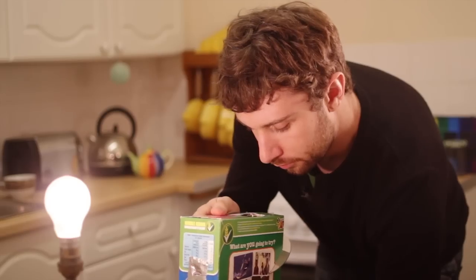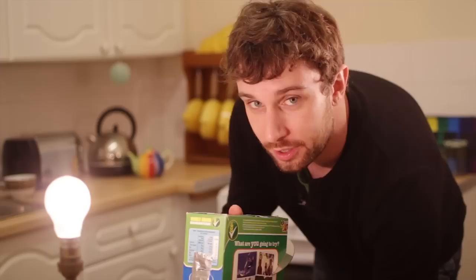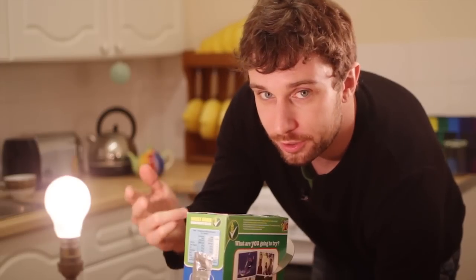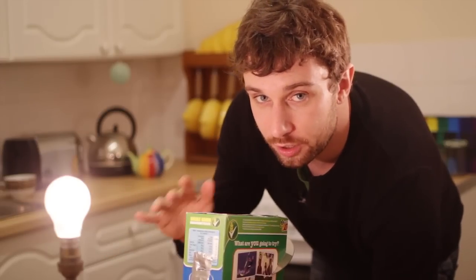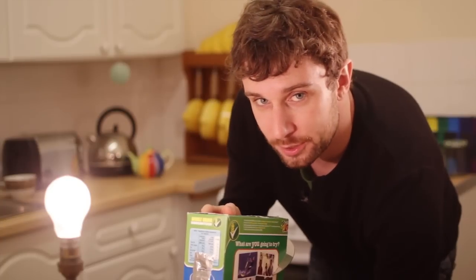Now you've just got to point this slit at any light sources you want to examine. So we might try a tungsten light bulb — that's one of the eco-unfriendly ones that get very hot when you turn them on. For a tungsten light bulb, you should see a complete rainbow: red, orange, yellow, green, blue, indigo and violet. That's because the white light given off by the tungsten bulb is actually a mixture of all those different colours — it's just that you can only see it when it's split up by the CD.